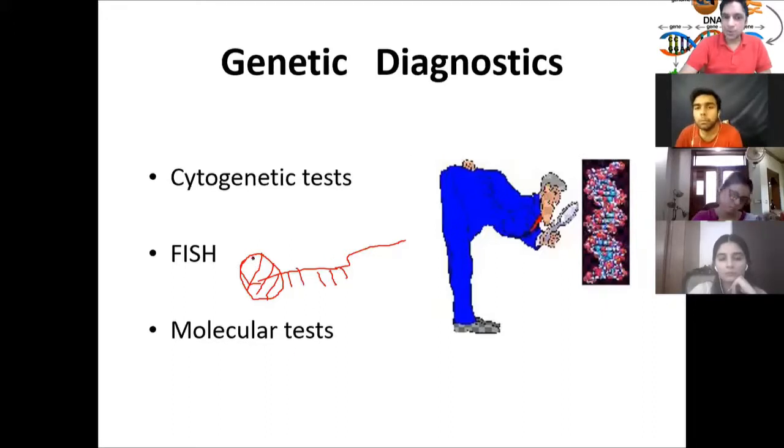And this fluorescent stuff will glow and let you know where that sequence exists.